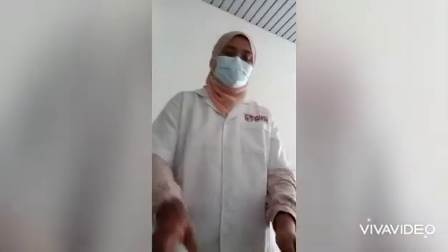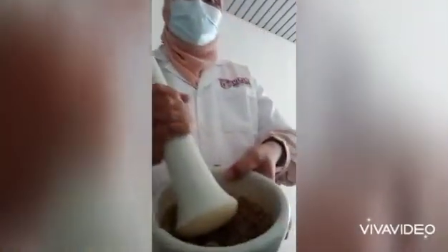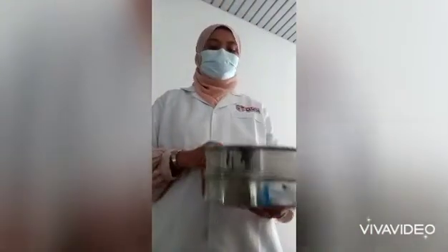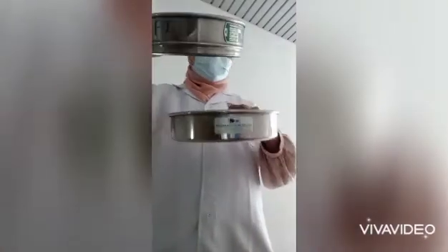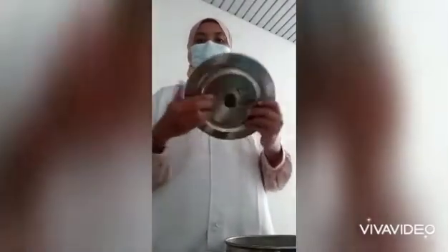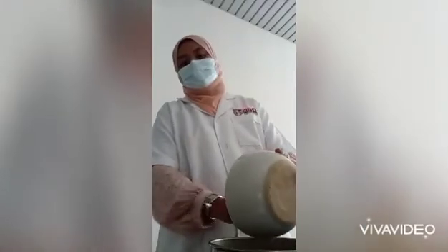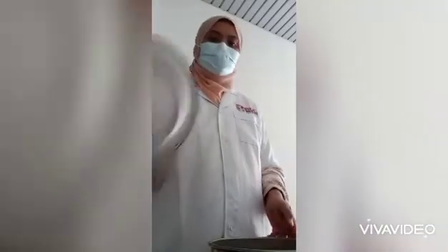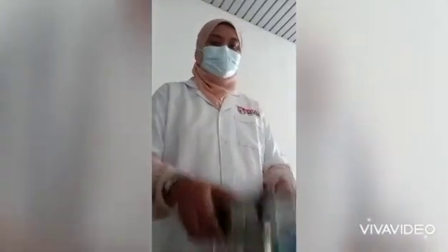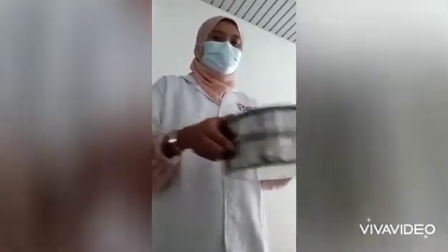By using mortar and pestle, crush and grind the soil until it turns to fine texture. Then take a sieve of size two millimeters like this, that has a collector at the bottom and also a cover. Place your soil inside this sieve and sieve your soil — shake, shake, shake.